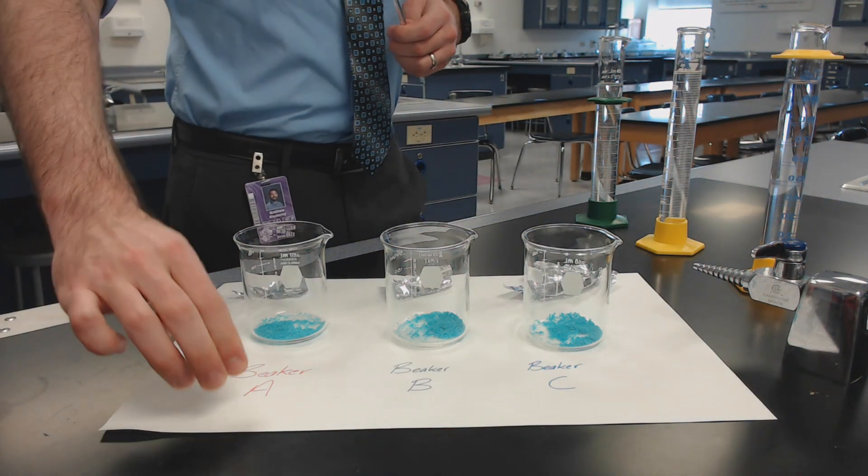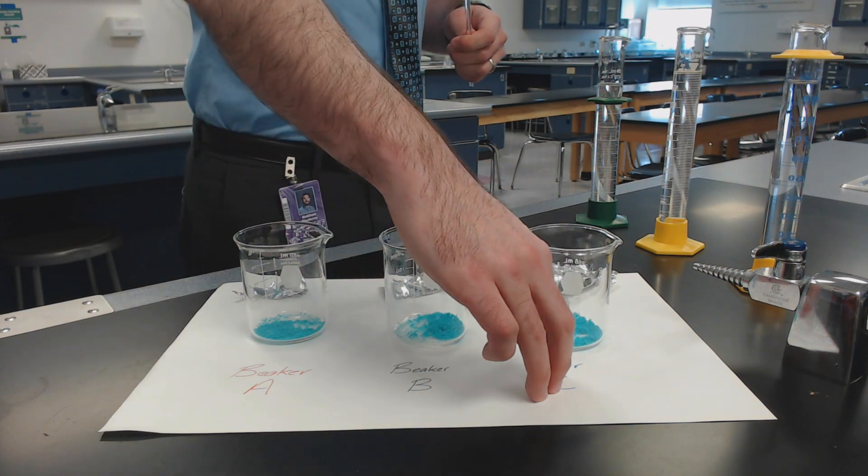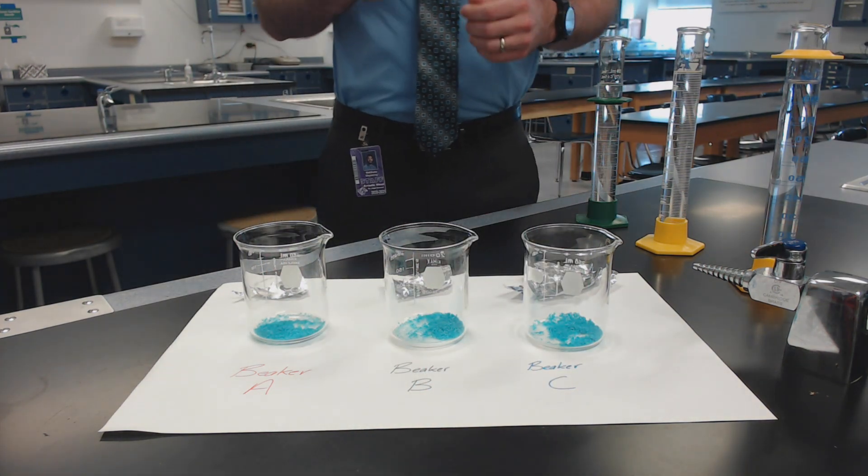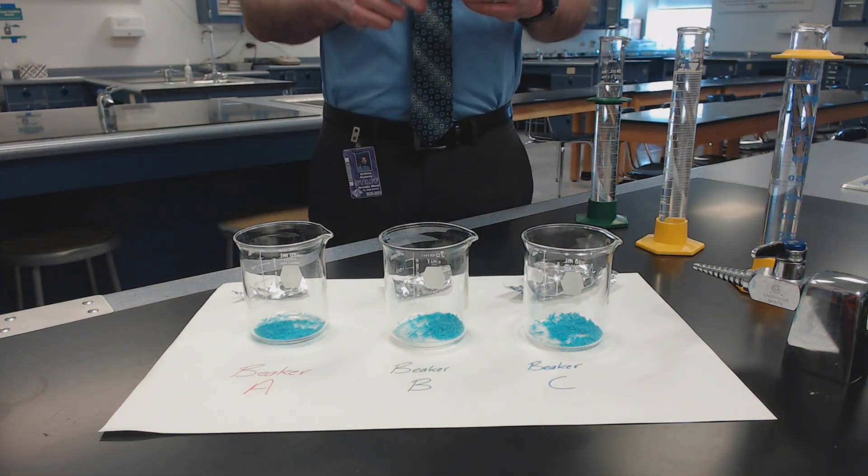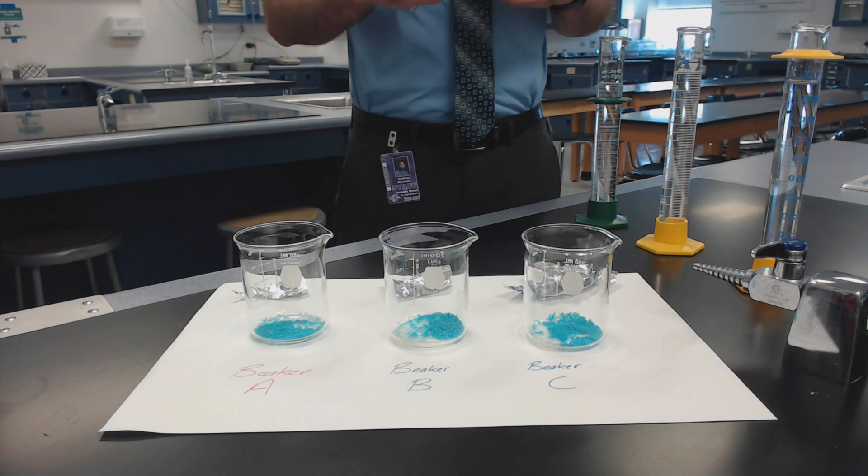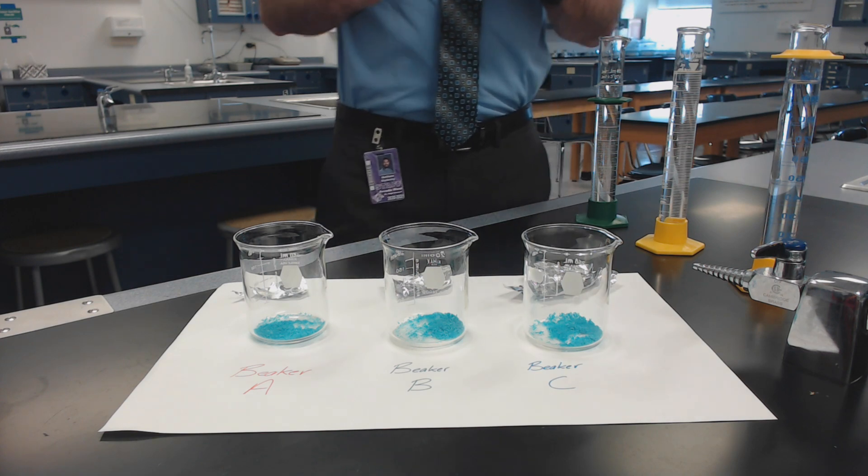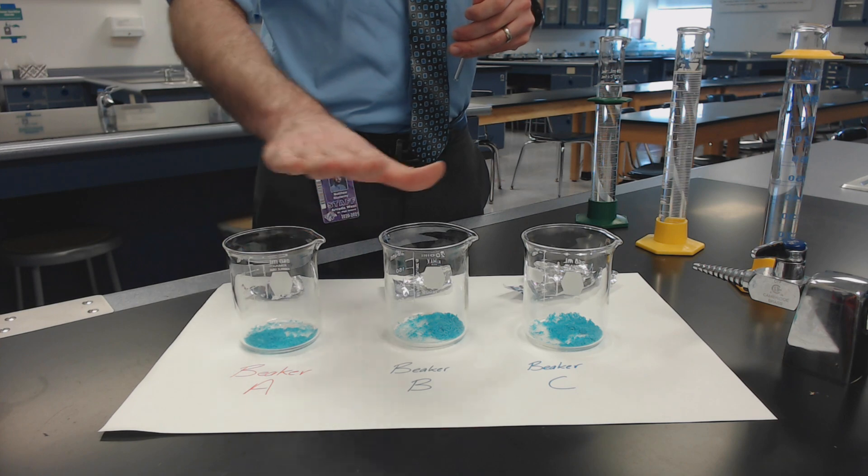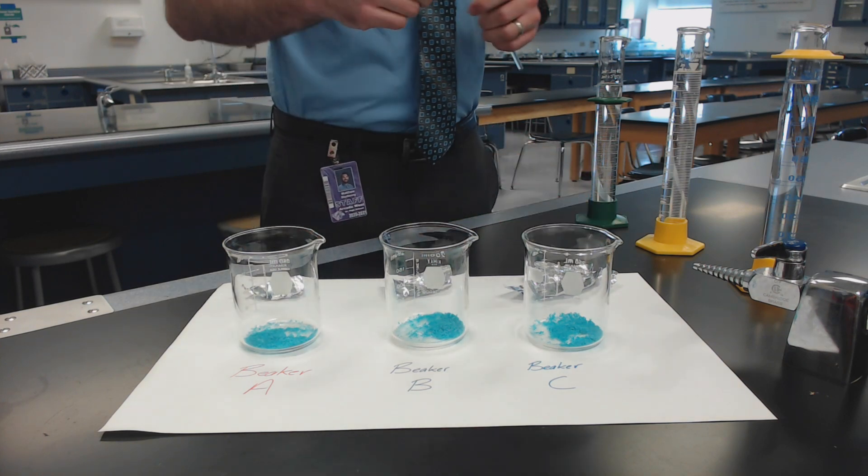This is beaker A, beaker B, and beaker C. Now each of you might have a different version of the lab, so the starting amounts are going to be dependent upon which version of the lab you have. However, the amount of the copper chloride in each of these beakers is the same.